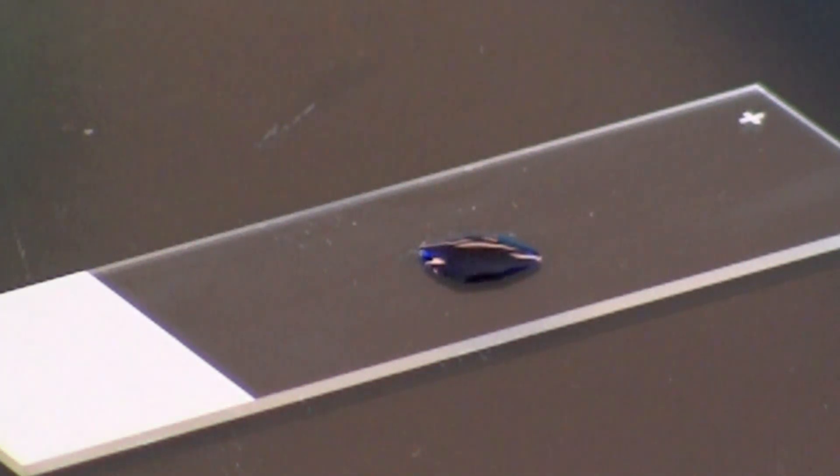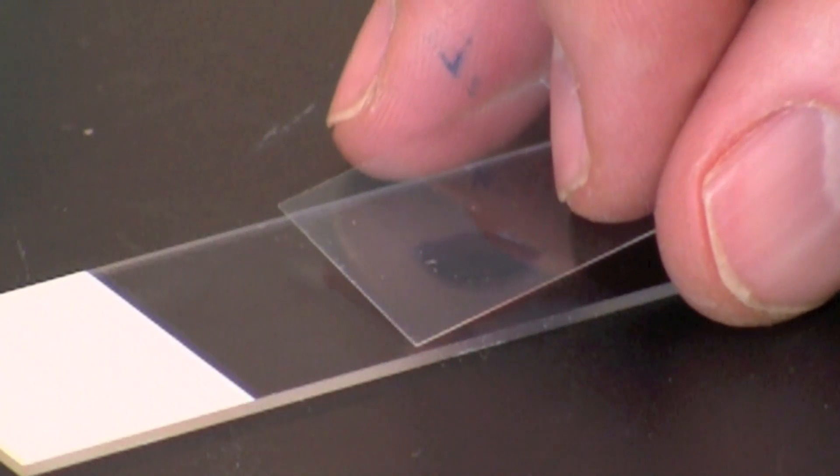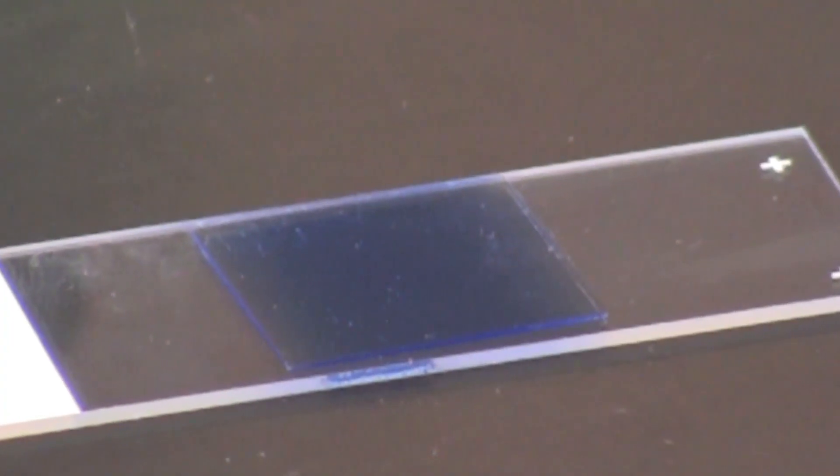Prepare the wet mount by lowering a coverslip over the stain, starting at a 45 degree angle. Avoid trapping bubbles under the coverslip.